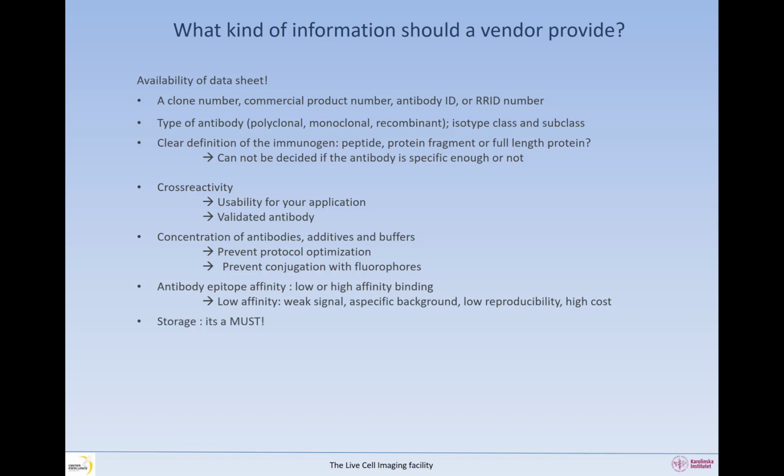How you should store your antibody, of course, it's a must. Considering the high cost of many antibodies, stability is very important. So a recommendation about storage conditions is a must.